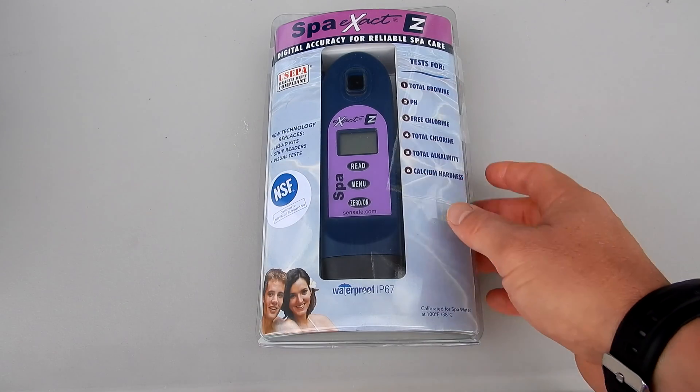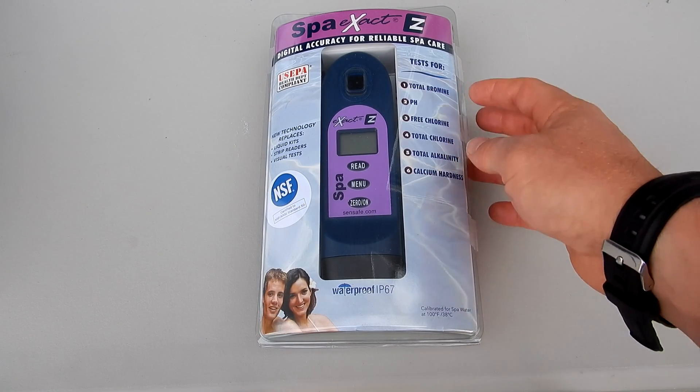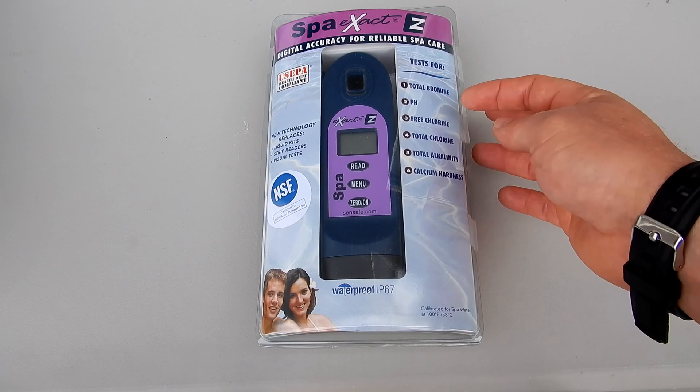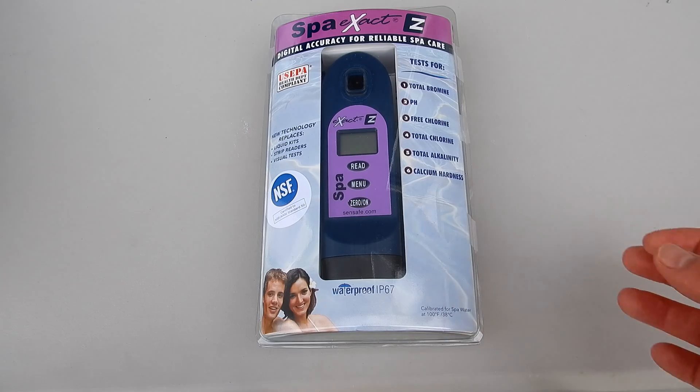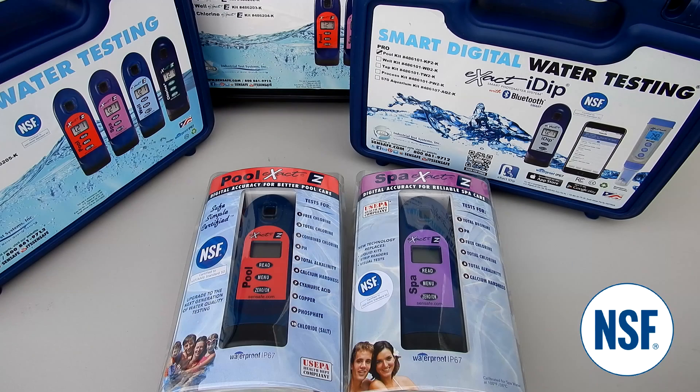And if you have a spa, the spa exact easy would be perfect. It runs six test factors: total bromine, pH, free chlorine, total chlorine, total alkalinity, and calcium hardness. All of the ITS exact photometers are NSF certified, which means that they've been tested and certified for commercial pool use.